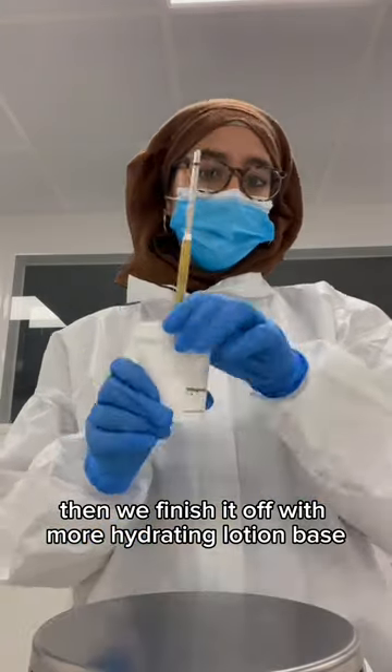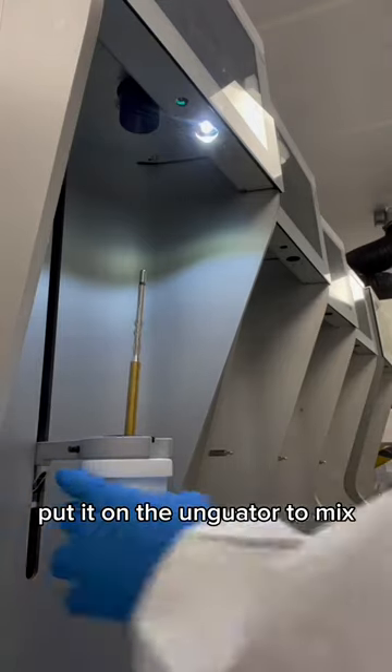Then we finish it off with more hydrating lotion base, pop the lid on, and put it on the Unguator to mix.